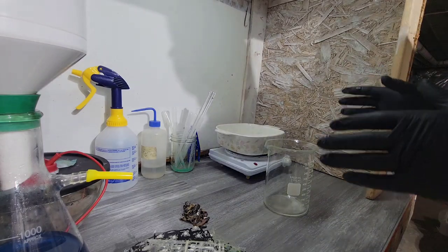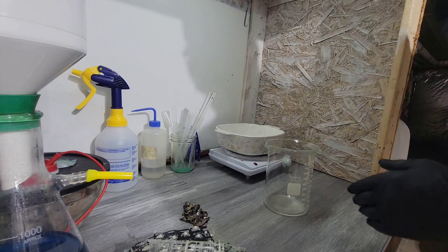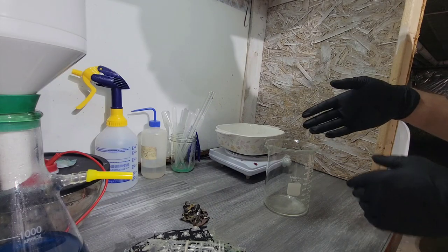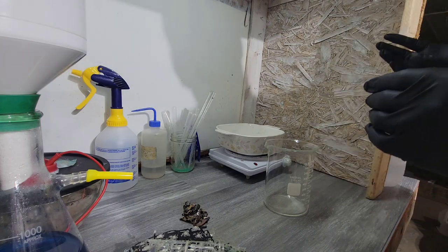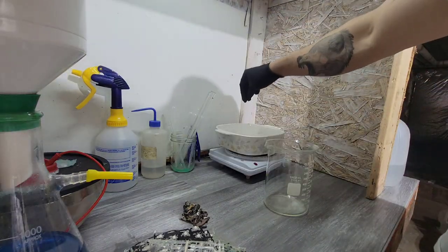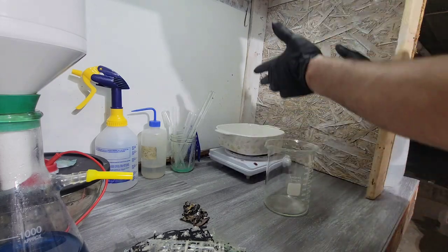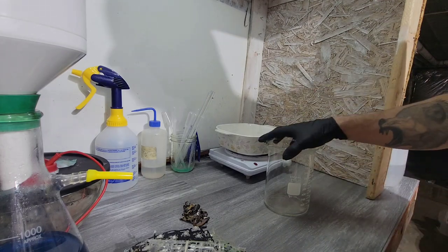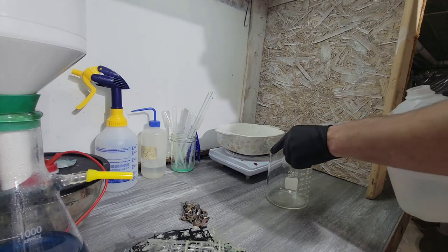But before I get into any dissolving, I'm just going to prep my station. I'm going to fill up my beaker, get my hot plate warmed up, the solution warmed up. I'm going to come back down here with my mask and some long sleeves because I have to basically dip one in at a time. So I don't want to do that here and let it be cold. We can just wait till the solution's hot, so I don't have to sit there for a while.